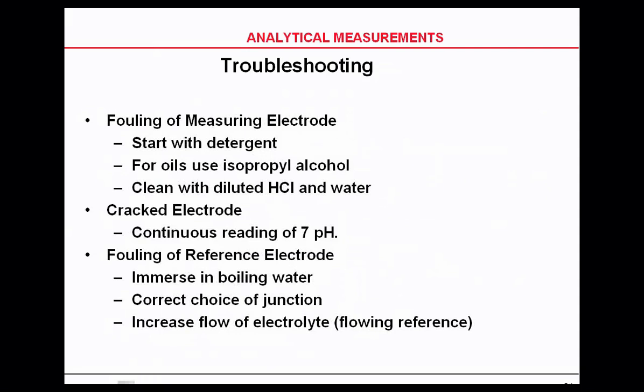Remember that if your glass electrode is cracked, it will show 0 millivolts, which corresponds to pH 7. To rejuvenate a dried reference electrode pulled from the shelf, immerse it in boiling water — many times this will loosen the potassium chloride and allow you to use it again.